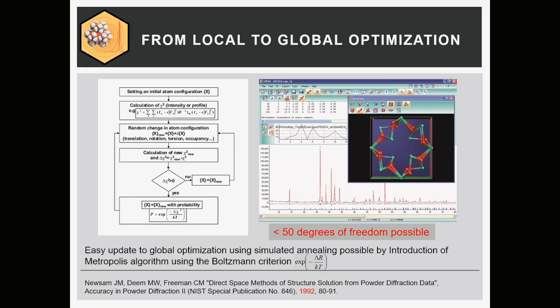And I'm not going into this, but there are zillions of more complex algorithms attached to it. You can do so many things. So the basic algorithm is pushed up a little bit with lots of mating and mutual change and genetic algorithms and I don't know what. But the basic idea is the simulated annealing, which in my opinion works best.